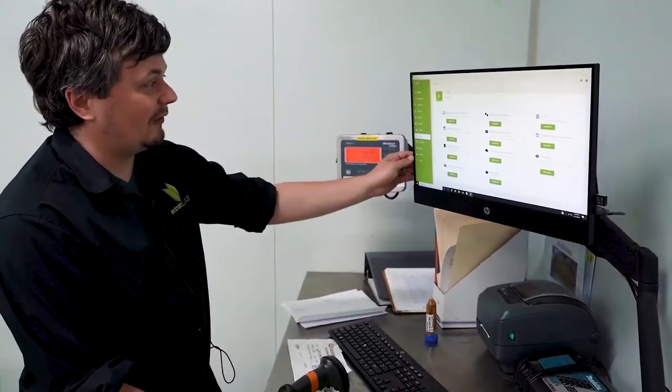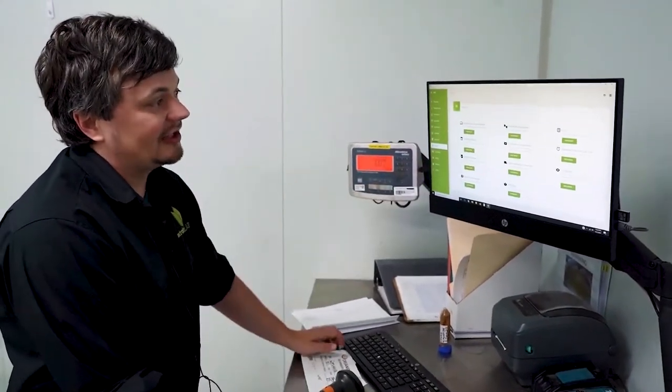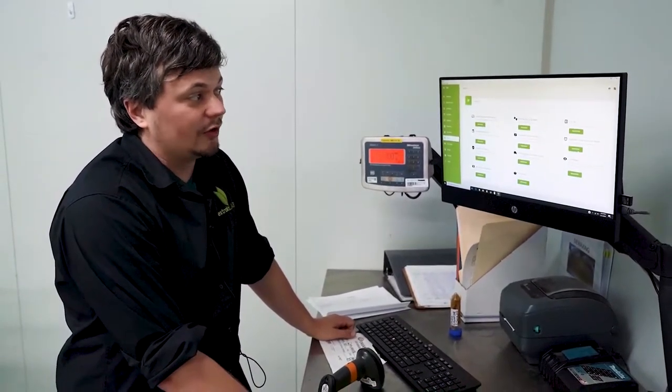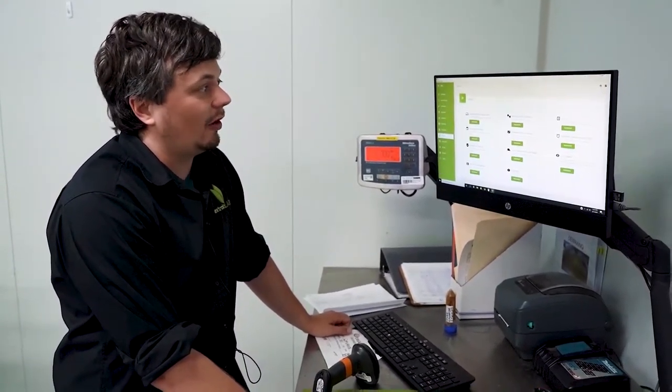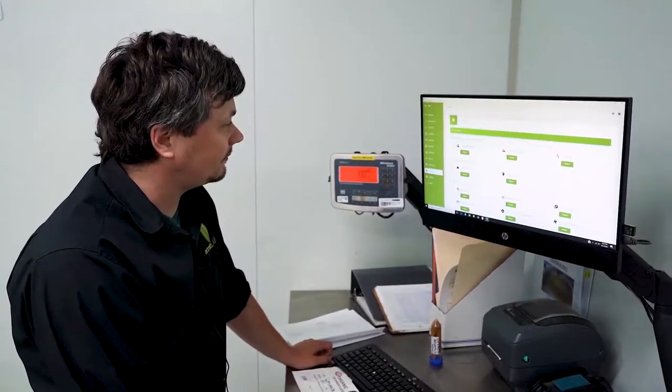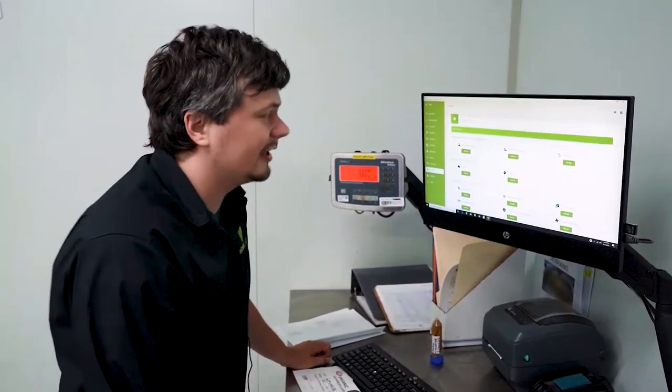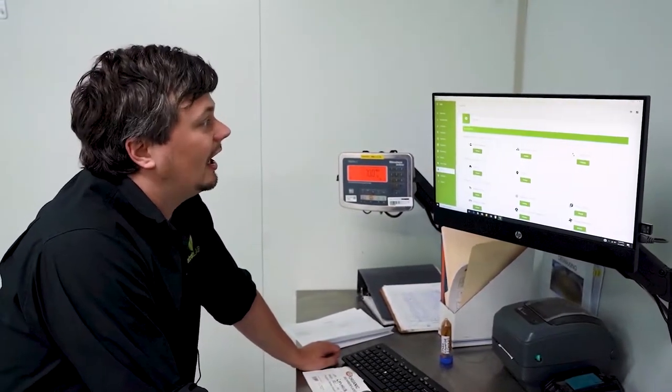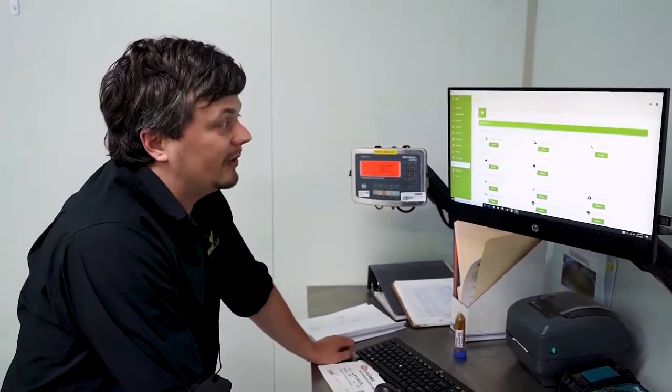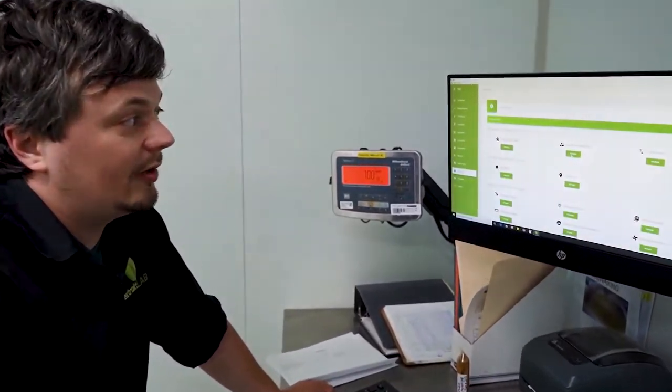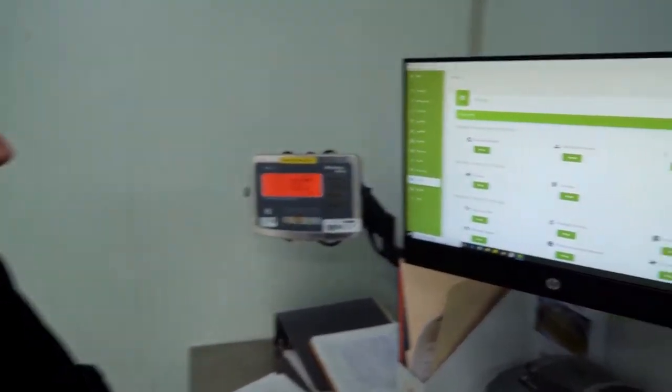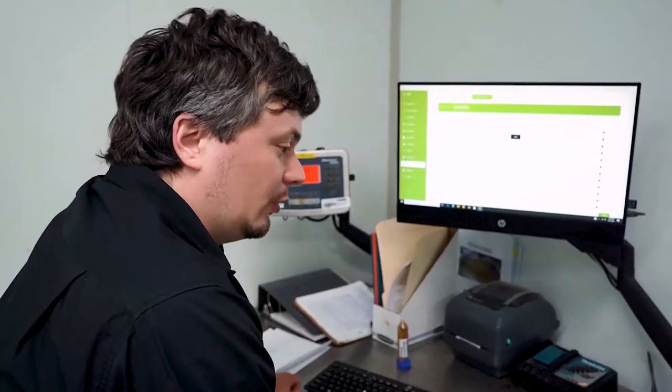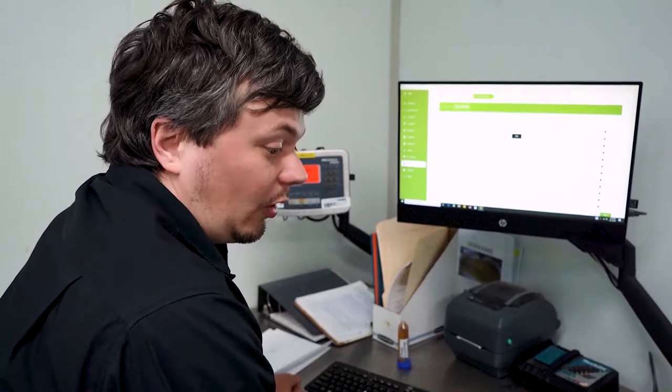Reports is a lot of fun. Lots of different kinds of reports. Like I mentioned before, equipment overdue actions report, lot lists. There is a ton of customizability. Permissions and roles can be created for all operators. So you can remove or add certain permissions.